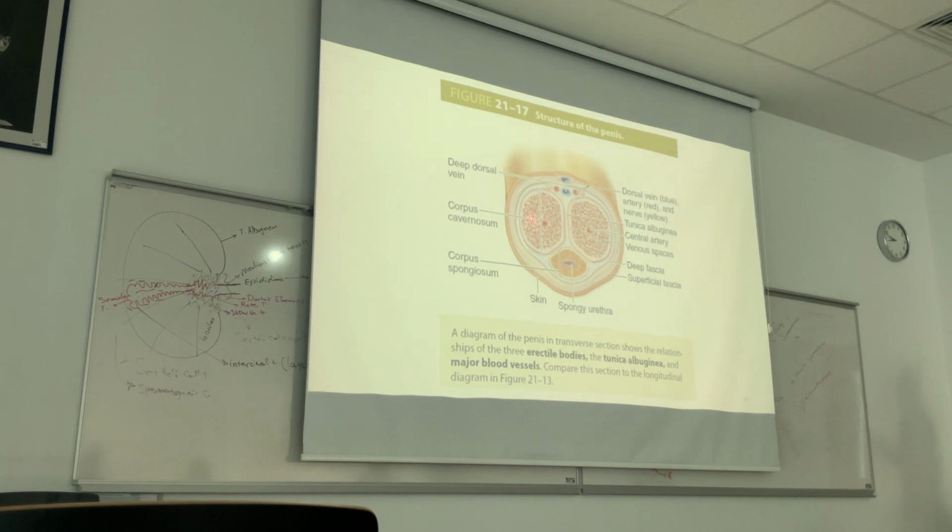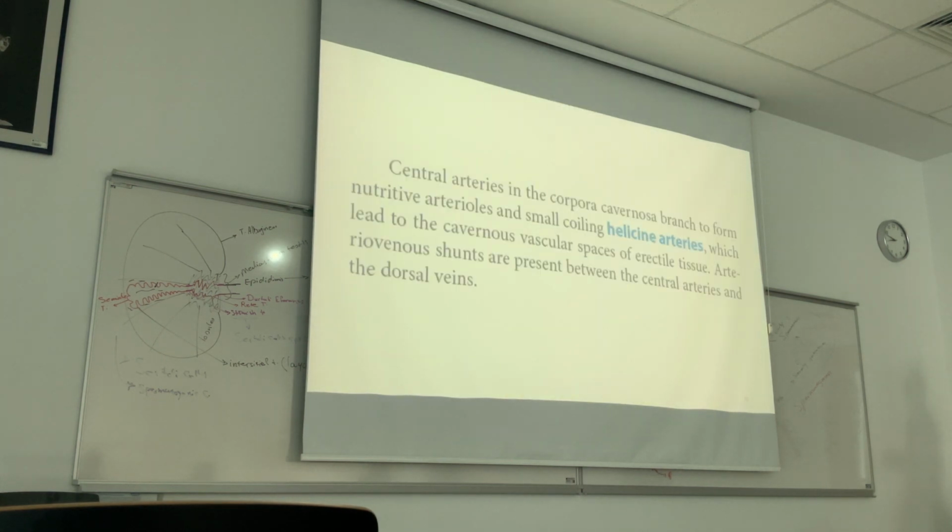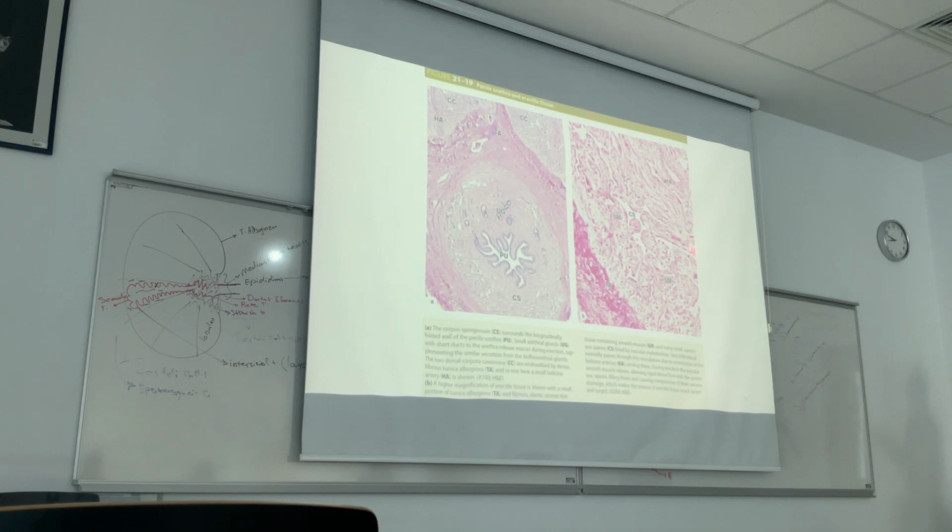In the inner side of the corpus cavernosum and spongiosum, generally the corpus cavernosum, we have these structures, trabeculae, which are composed of connective tissue and smooth muscle cells and cover the cavernous sinuses. In the wall of the cavernous sinuses, we have endothelial cells, and just beneath these endothelial cells, we have a high amount of smooth muscle cells.